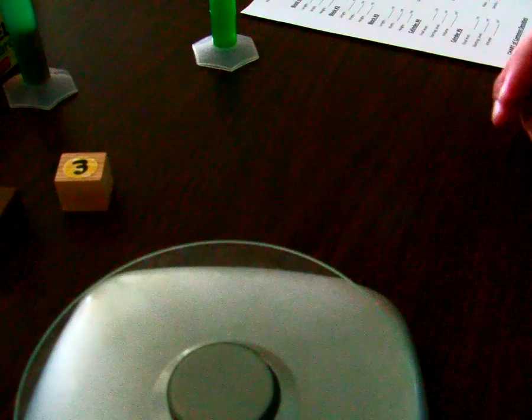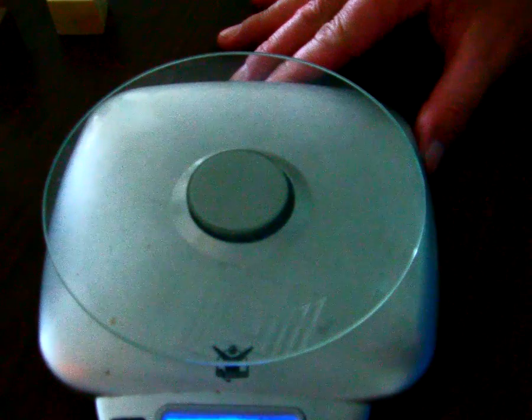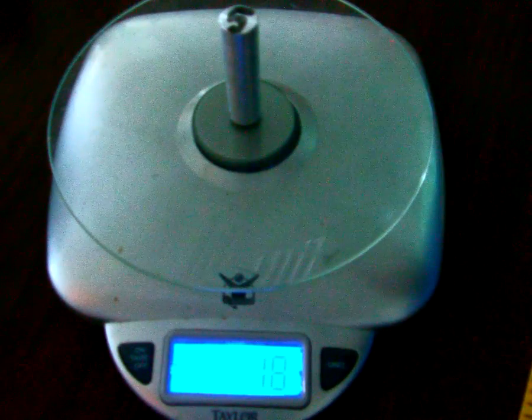All right. Now we're going to go ahead and move to cylinder number 5. We are going to start out with cylinder number 5. We're going to mass this. It comes out to 18 grams, cylinder number 5. The mass is 18 grams. Go ahead and record that onto your lab data sheet. 18 grams, cylinder number 5.